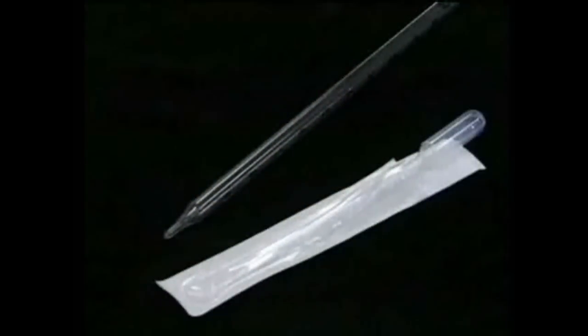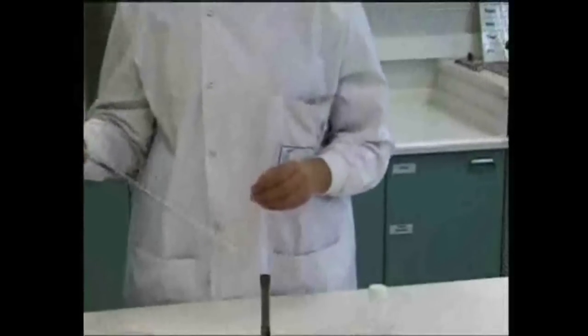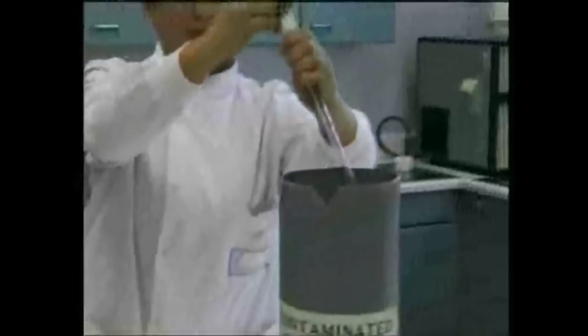Pipettes are supplied sterile, either individually wrapped or packed into a container, whose top should be flamed on opening. Pipettes are flamed by flashing through the Bunsen flame in one continuous movement, and are discarded into disinfectant after use.